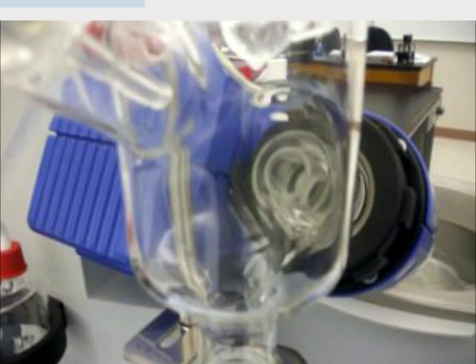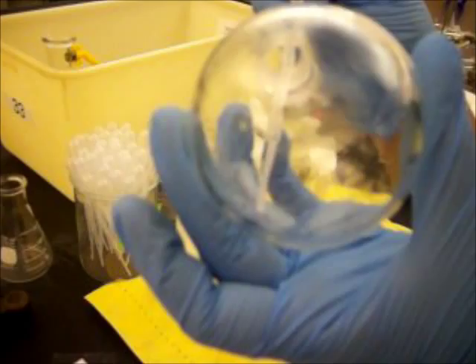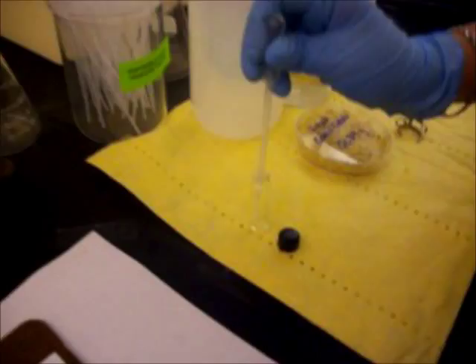After the removal of the dichloromethane, there should be approximately 1 milliliter of pure furfural. First, get a tare measurement of the empty vial. Extract as much furfural from the round bottom flask as possible and place it in the vial. Record the final mass of your product.